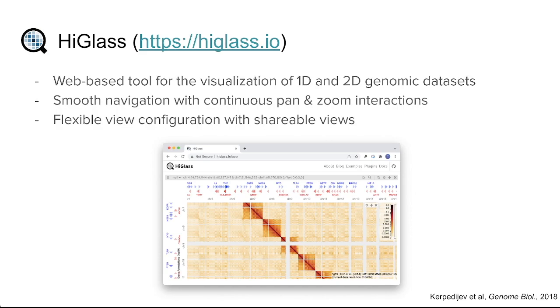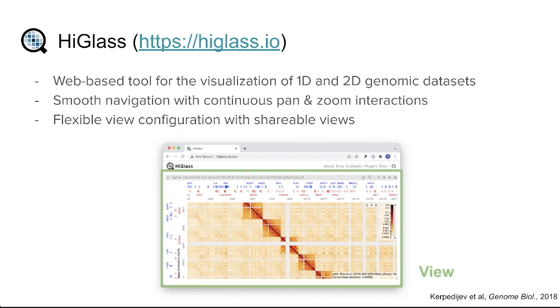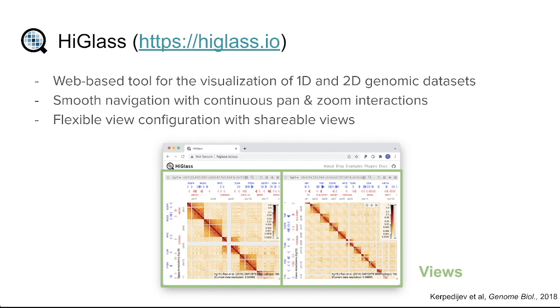HiGlass is a web-based application designed for the visualization of 1D and 2D genomics data. It provides smooth navigation via continuous zoom and pan and interactions that include flexible view configuration. HiGlass contains separate views that describe the visual surface of the web browser as well as views that can be linked together seamlessly.